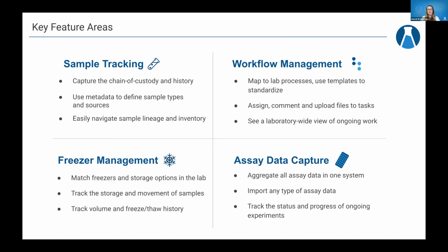the workflow management, where you're able to map lab processes and use those templates to standardize work in the lab. And so what we often see people do is creating workflow templates that map to standardized SOPs or to processes that they're doing every day in the lab, like shipping or receiving or uploading assay data.